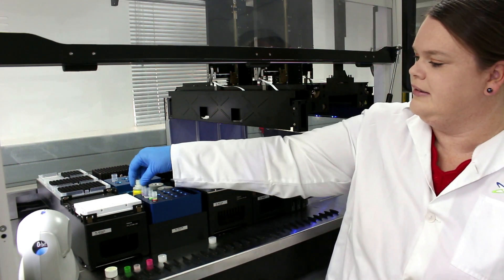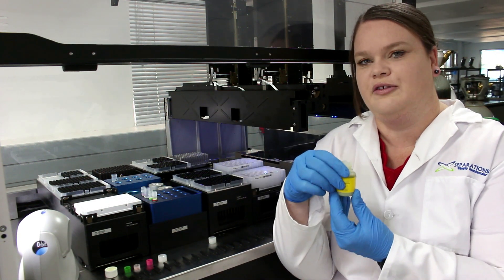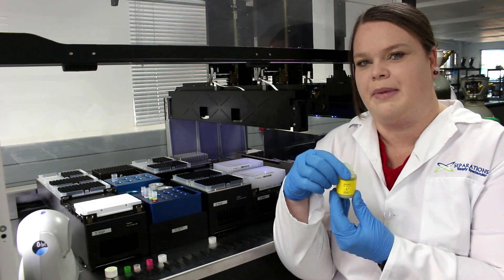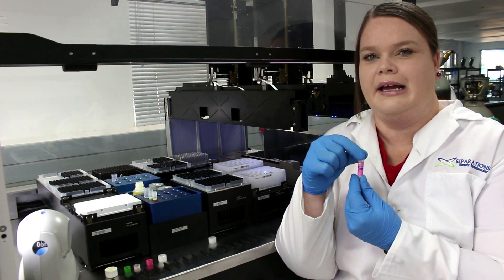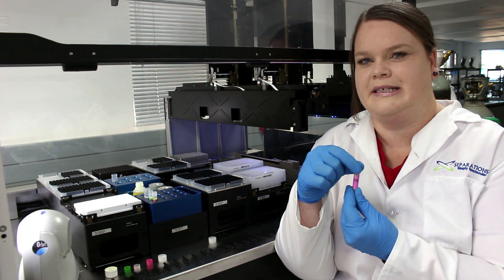In order to do the DNA extraction, we require a lysis reagent. The lysis reagent is used to break down the cell walls of the pathogen. Reagent B includes the probes and primers specific for the PCR.